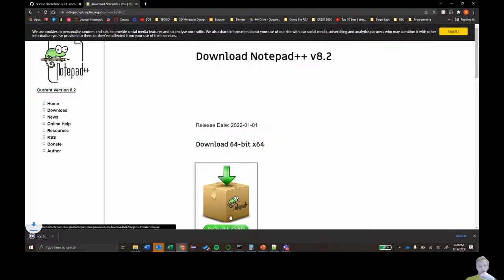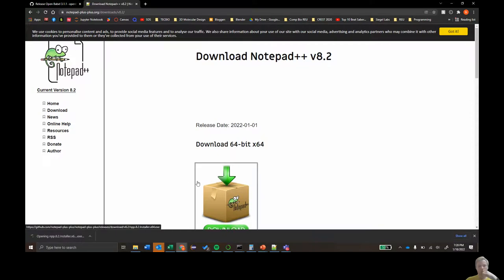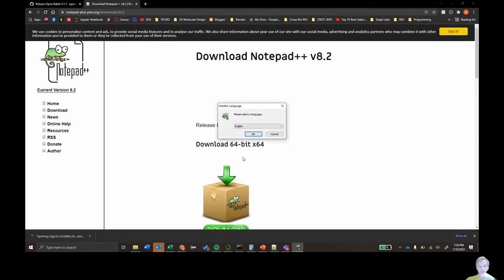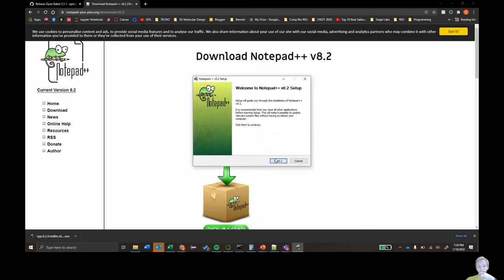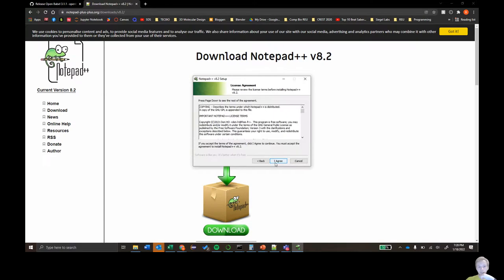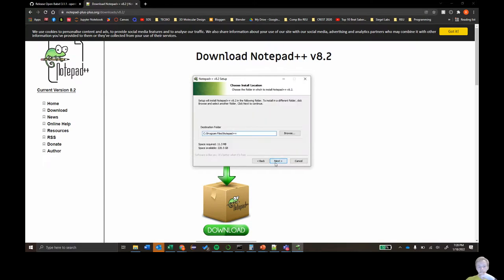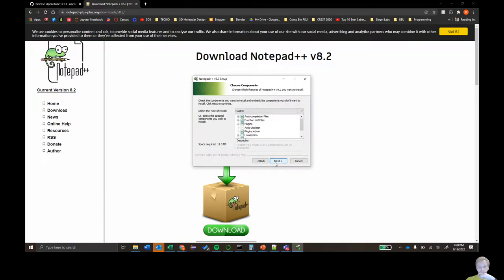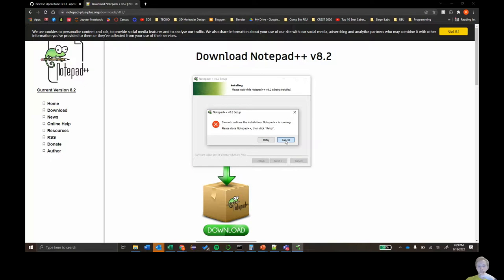It shouldn't matter which version. Download it, run the installer, and click OK, English, next, next, next, next, next. I already have it installed so I won't do it, but that's the basic path. They're both pretty simple softwares to install.